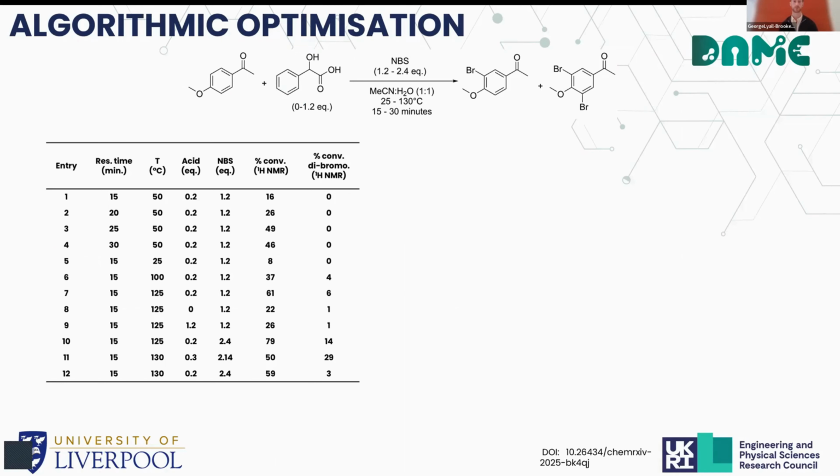The 12 data points that we collected as part of that screen were compiled to form a training data set for subsequent algorithmic optimization.